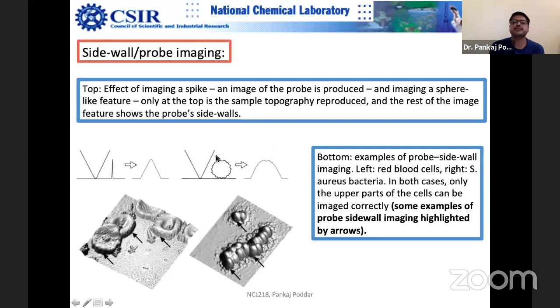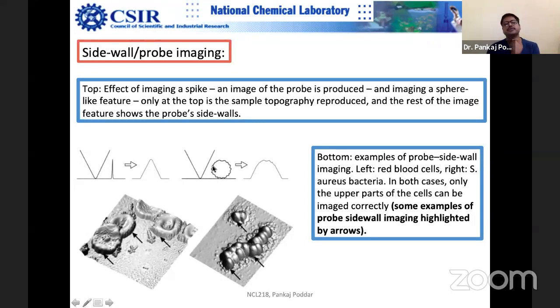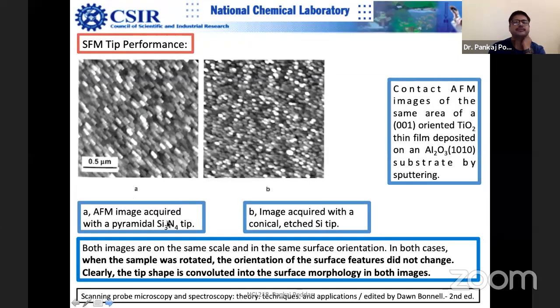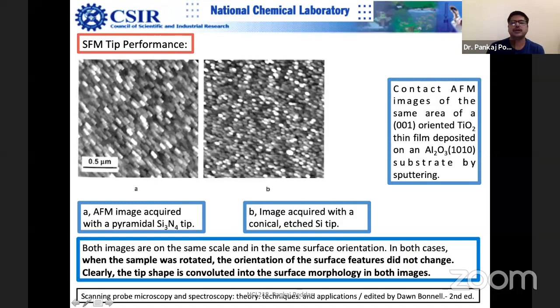Another example: for spherical particles, you can see that the sidewalls are broadened and the sphere doesn't look spherical. This AFM image was acquired with a pyramidal silicon nitride tip used in contact mode. Another image was acquired with a conical etched silicon tip used in tapping mode — this is the etched tip. You can do chemical etching in your own lab. There is a sharp difference between the two images.